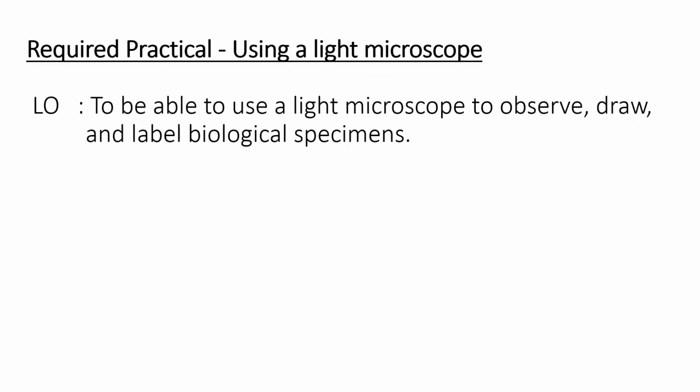Hello Year 10, and today we are starting the first of the required practicals. We're going to be using a light microscope. Now this is a very simple practical and I'm sure lots of you have done it multiple times. However, for those of you who haven't, or it was a long time in the past, we're going to go through it step by step and look at the sort of questions they may ask.